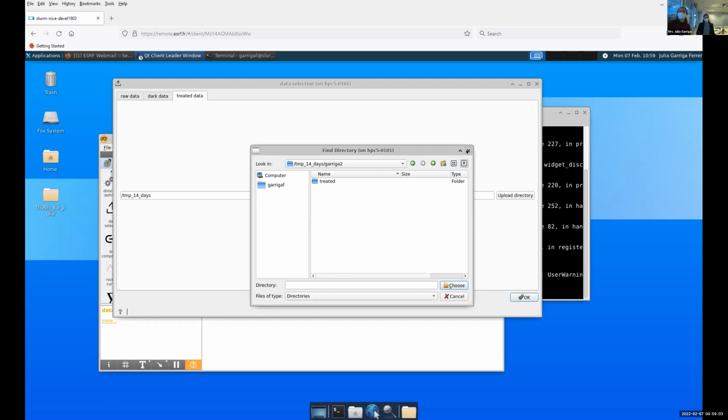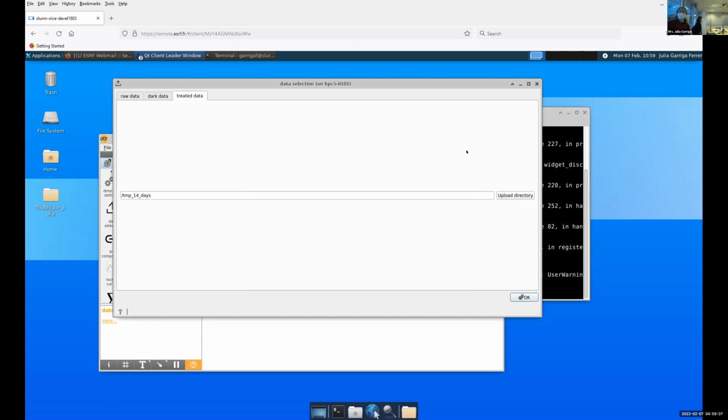Are you in Guacamole? No, I copied your data set, but I installed it on Friday, the latest version. Friday afternoon, yes. First question: is it a Linux install or a Windows install? Linux.